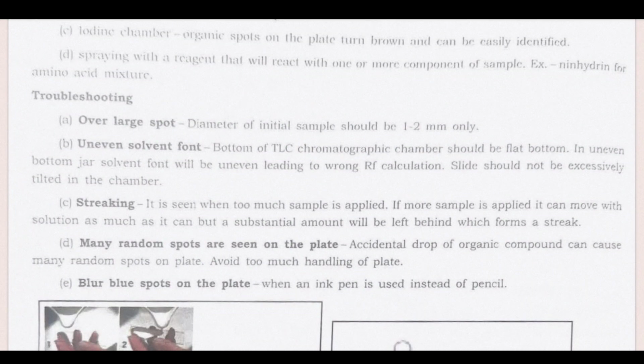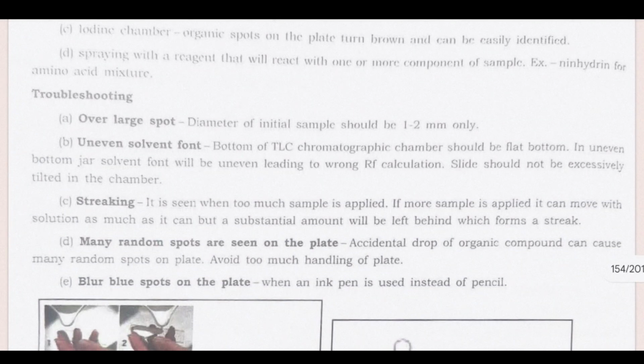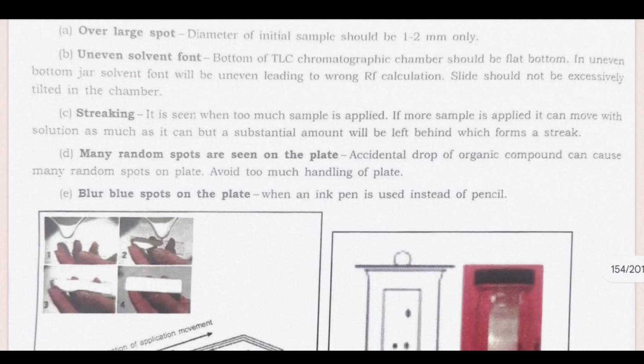Many random spots are seen on the plate. An accidental drop of organic compound can cause many random spots on the plate. Avoid too much handling of the plate. Blur: a blue spot on the plate appears when an ink pen is used instead of a pencil.